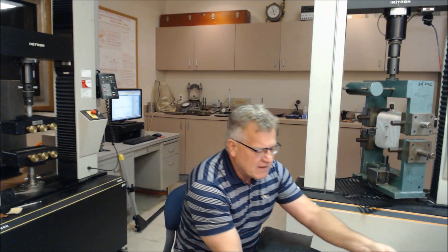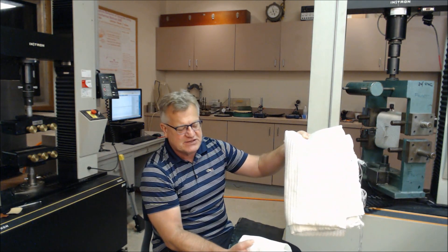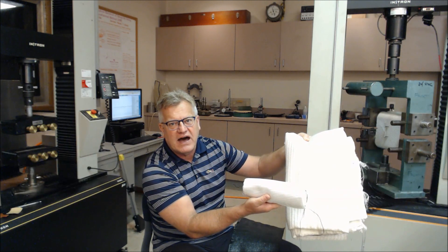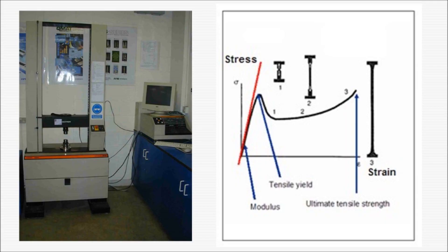It gets more significant when you have very high-strength materials, high-strength polyesters, and then you're going to have to orient that. You sometimes have to do that with a hot knife rather than a pair of scissors or shears. In all cases, this is an 8-inch wide specimen. The properties which you'd like to obtain from this method are strength, elongation, and modulus.